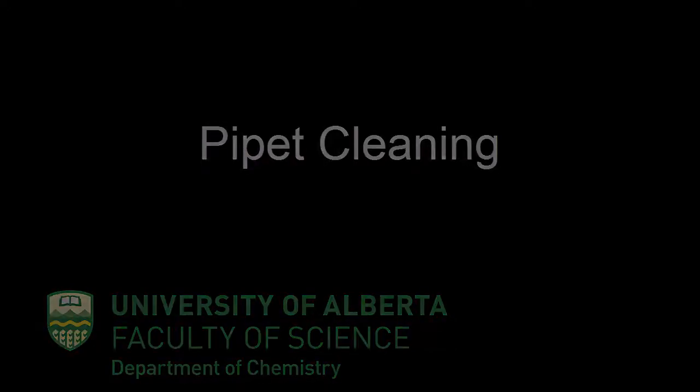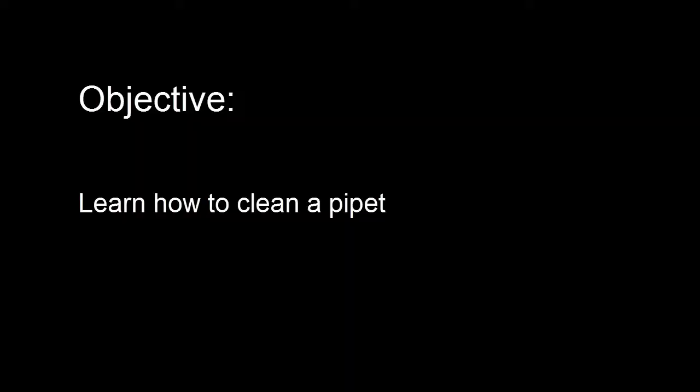Pipette Cleaning. The objective of this video is to learn how to clean a pipette.